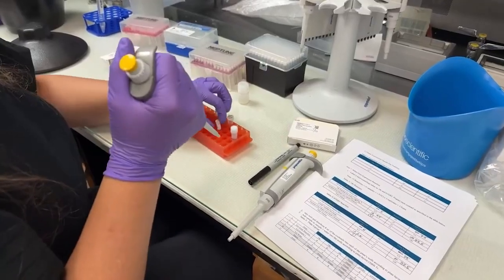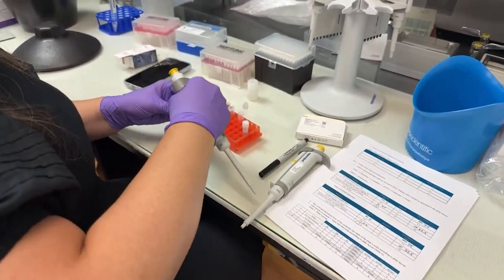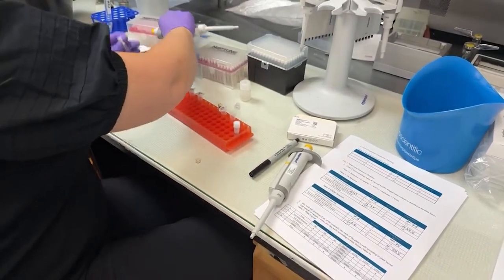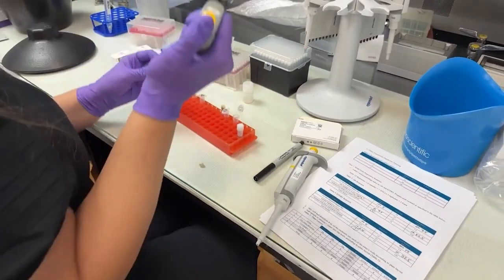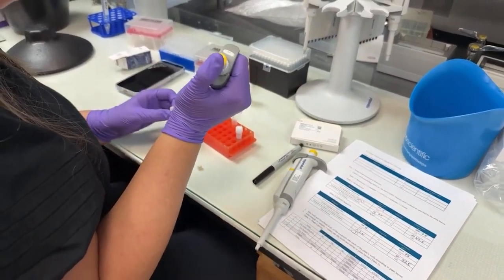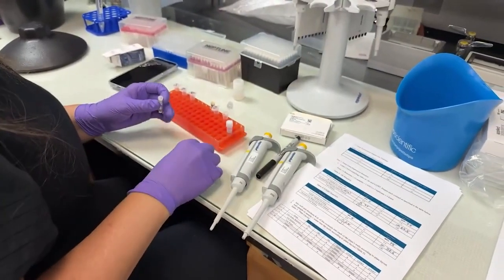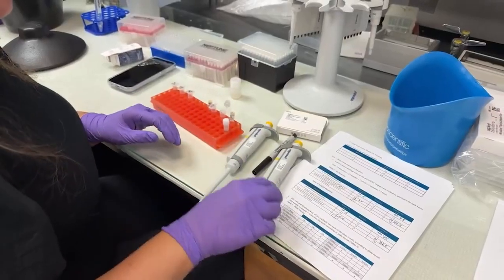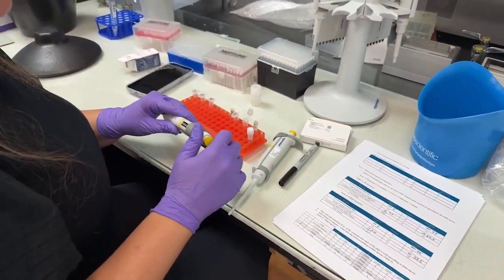So now I can move to my assay mix. Also, keeping the box of tips closed when you're not using it will help keep your whole environment clean. It's another good tip. And now we add 37.5 of our water.